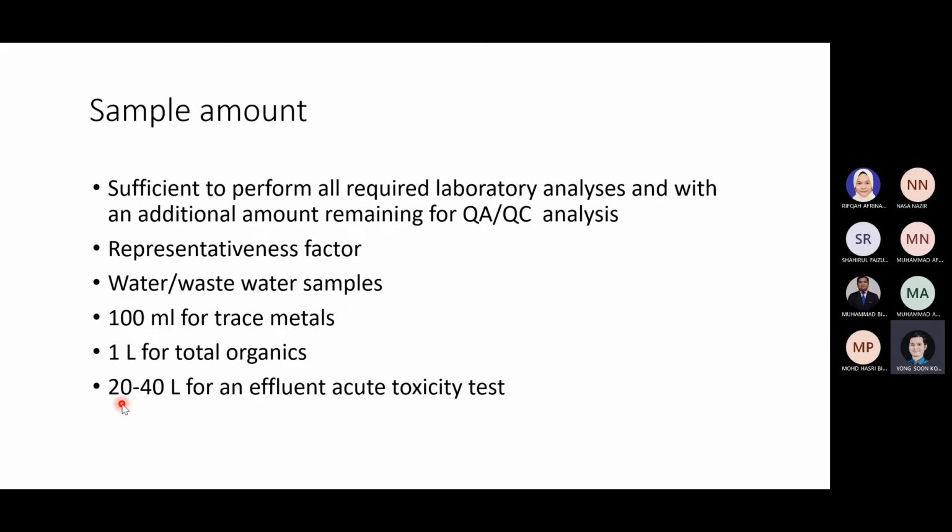So this one you may have a bit more requirement from the test itself. So you need to know what methods you use. But usually that is the general idea of how much water you have.